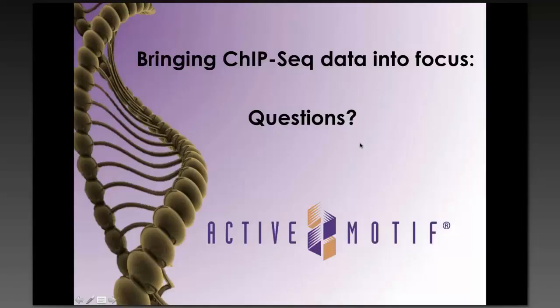Have you worked with any peak caller labs to have a patch that would allow you to run tools taking into account the spike-in aligned files? And if so, which tool did you use, MACS or some other? No, right now I'm not the bioinformaticist, but what I can say is it's all kind of done manually at this time. There are no tools available. We're mapping separately to the human genome. For K27, we use SICER.